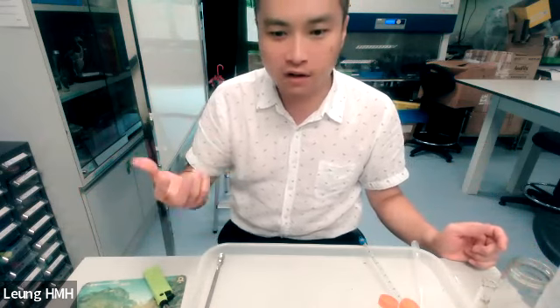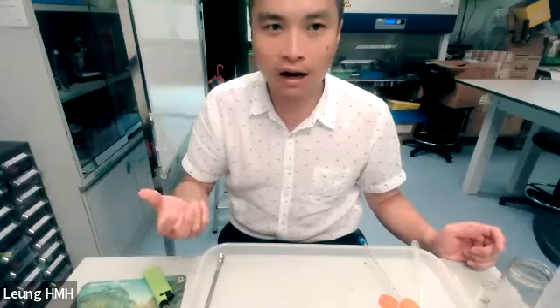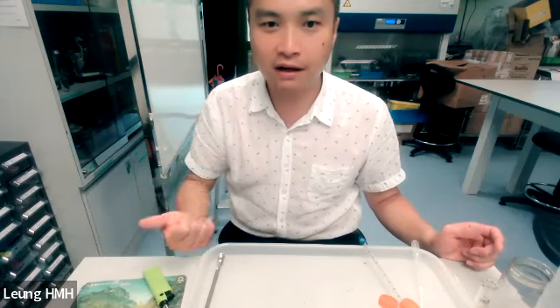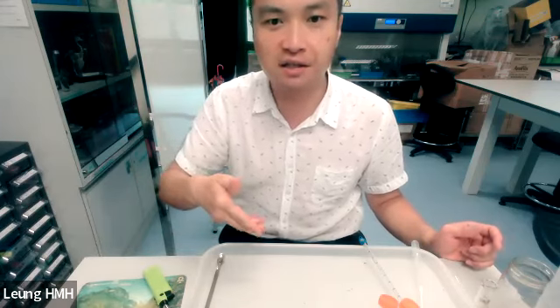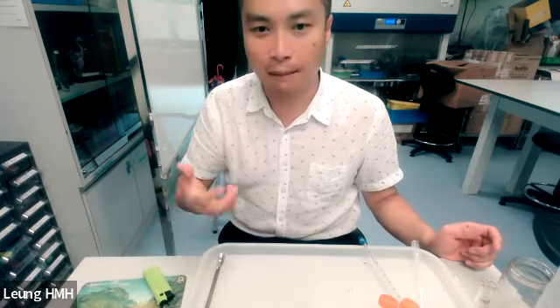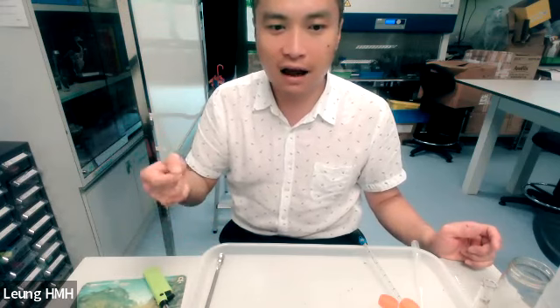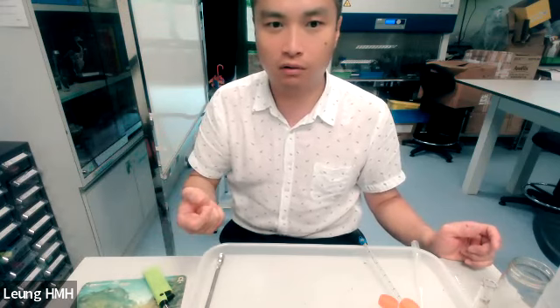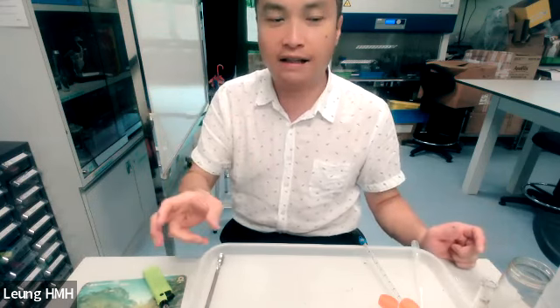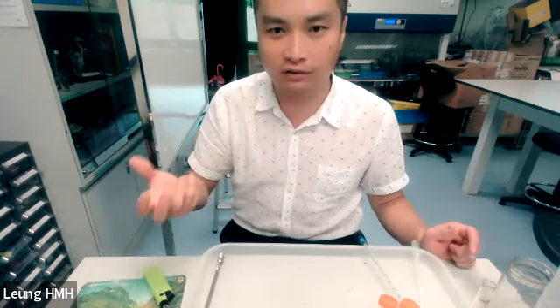The first thing, we heat up the oil at around 55 to 60 degrees Celsius, and then we add the catalyst, in an approximate amount, and we add 10 ml of methanol into the mixture and shake it rigorously. And during that time, we need to release the gas within the container.